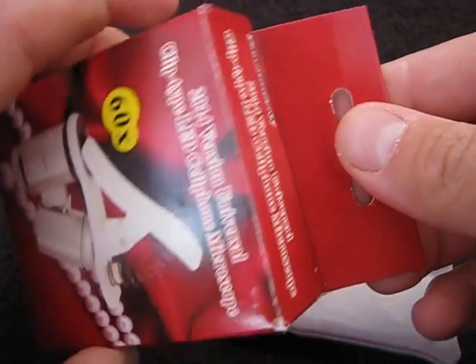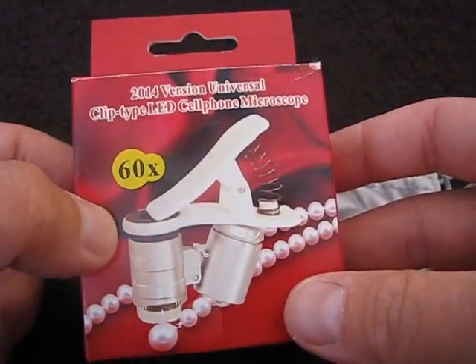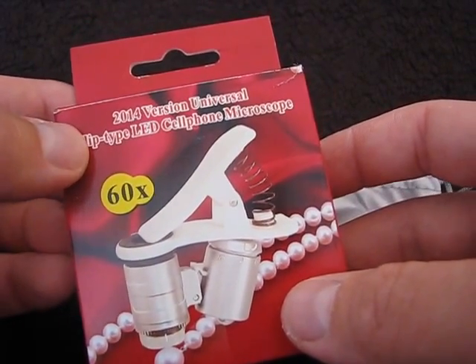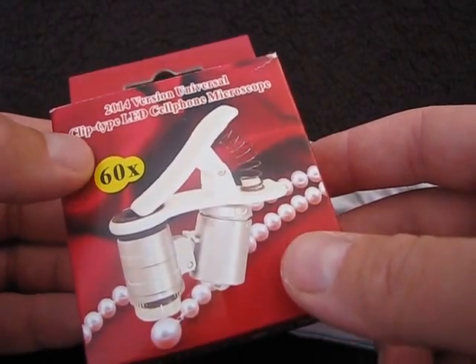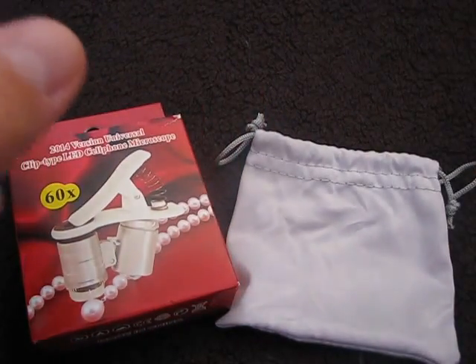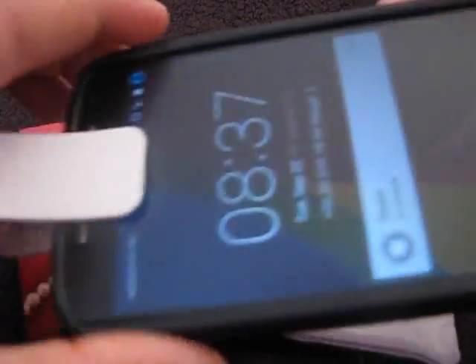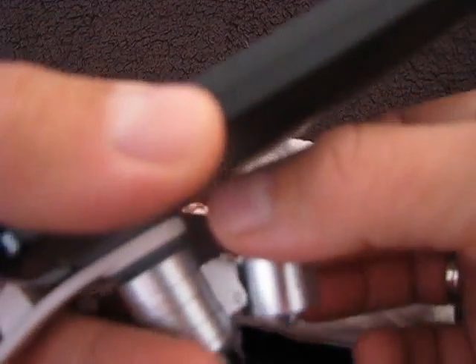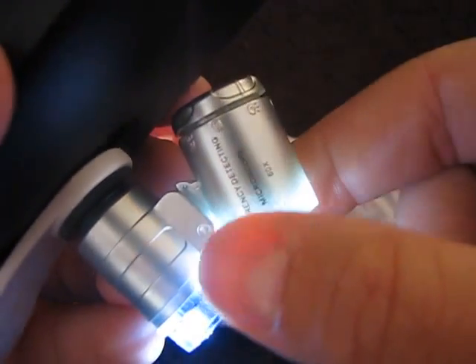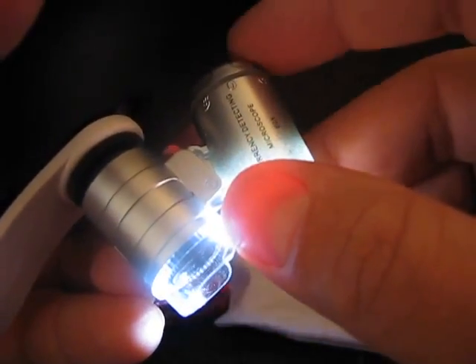It's pretty cheap, just a few dollars. I've been using it for a few weeks and I can say it's worth the price. It's not a sophisticated quality thousand-dollar microscope, but it does the job for around 6 USD. You can clip it onto your smartphone and it has an embedded light source powered by a battery inside the plastic tube housing. You can rotate the head to replace the battery.